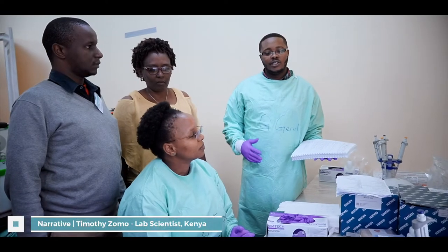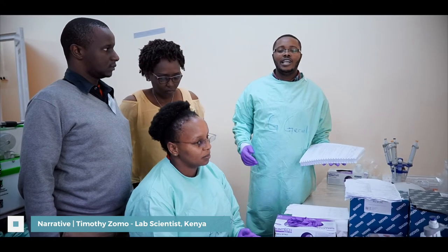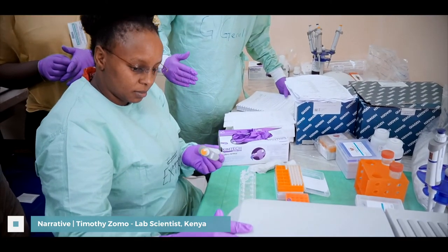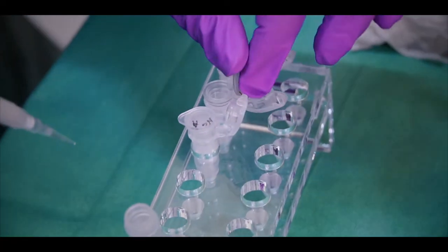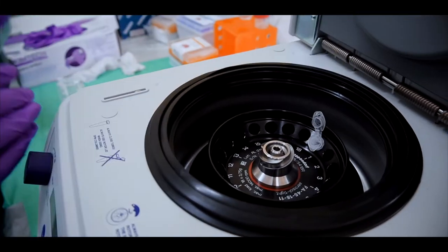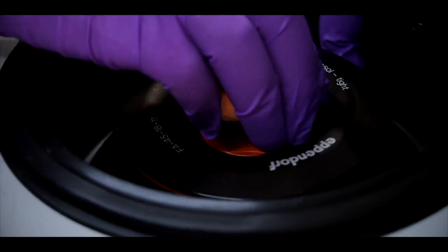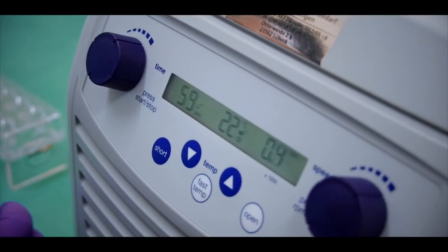In this workstation we do sample extraction, where we extract the viral RNA while adhering to the standard operating procedures. We have just done the washing steps — washing step one and washing step two. She is now doing the elution of the viral genetic material. The next step is the final centrifugation step: she will centrifuge the eluate at 8000 rpm for one minute.